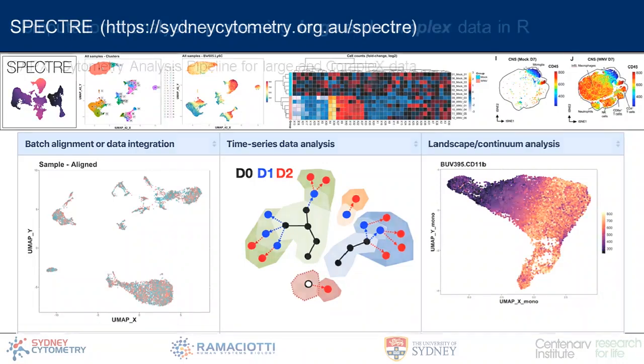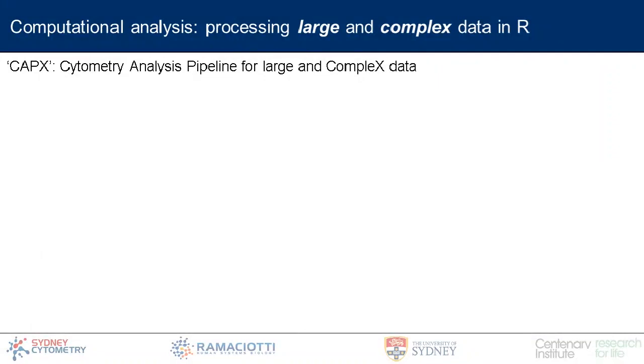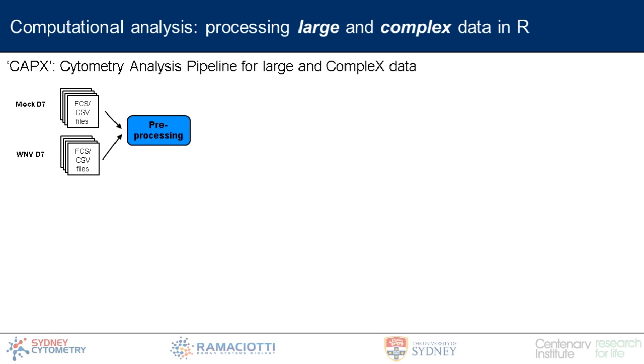Now, what this looks like broadly in terms of the analytical workflow is we need to take our data sets, and we need to be able to, first of all, mix these together and do some pre-processing. Now, the pre-processing is largely about preparing the data for our analytical profiling. Once we have this data prepared, we can do some clustering.